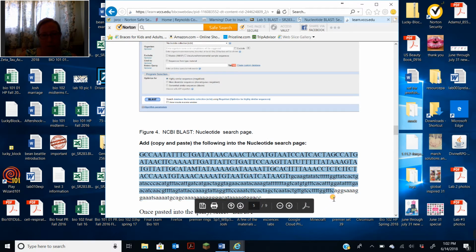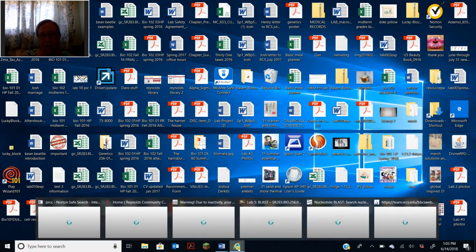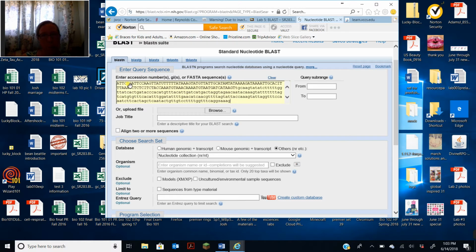I don't want it to give me that once pasted thing, but well, that's fine. Okay, so I'm going to copy that out and go back to the BLAST. Where is it? There we are. And I am going to just paste it right in here. Just like so. And it's going to tell me that if I wanted to specifically do human genome, I could do it there, or mouse, or others. I'm going to leave it on others because we don't know what it's from, and that's what we're trying to find.